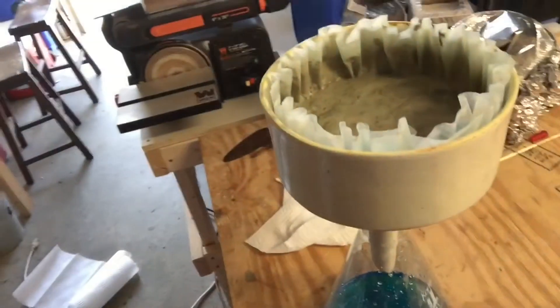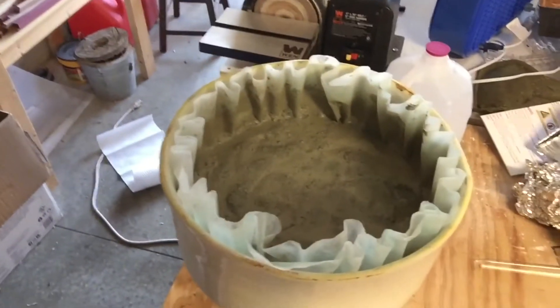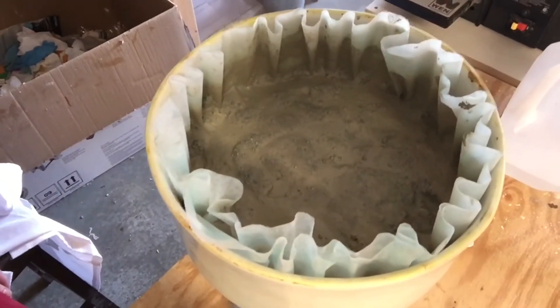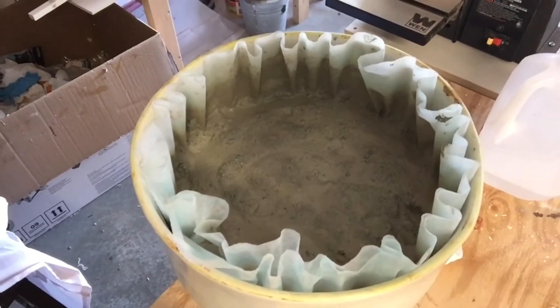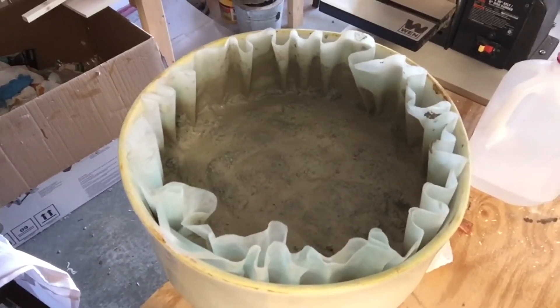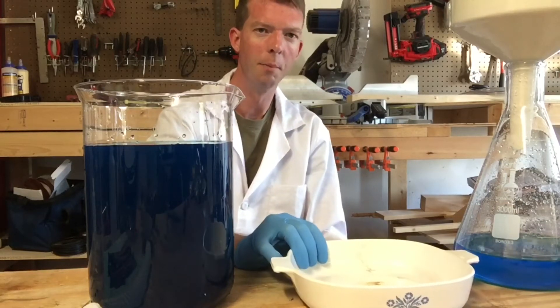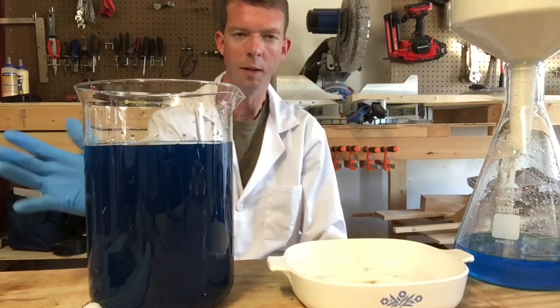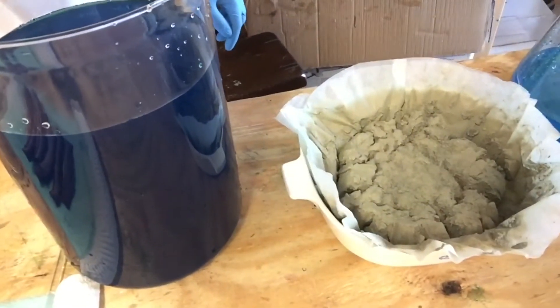We ended up with a whole lot of muddy silver there — it's really pretty. Once this is completely dry I'm going to take it out, melt this down into a nice bar and we'll see what we get. It's pretty much done filtering so we're going to take this out. I'm going to put it in my Corningware bowl overnight and let it dry out, so tomorrow we can have a nice fine powder. Look at that — a whole lot of pure silver.